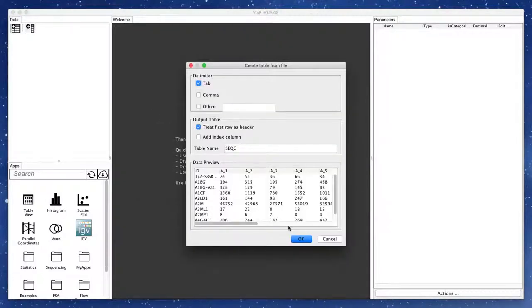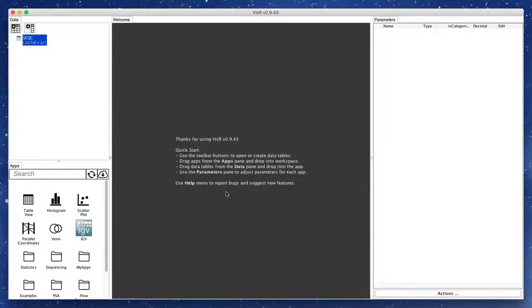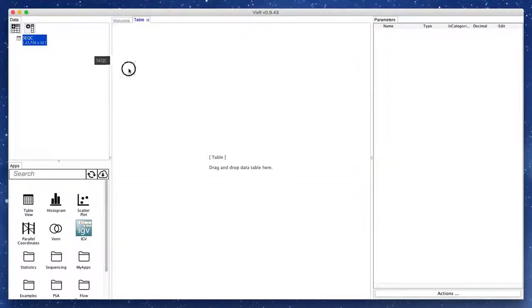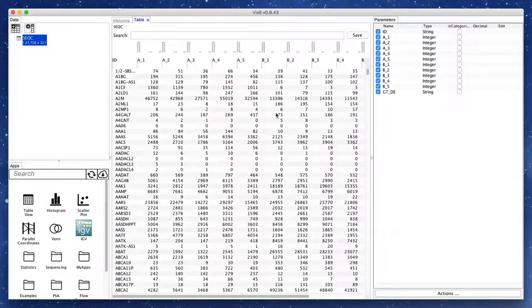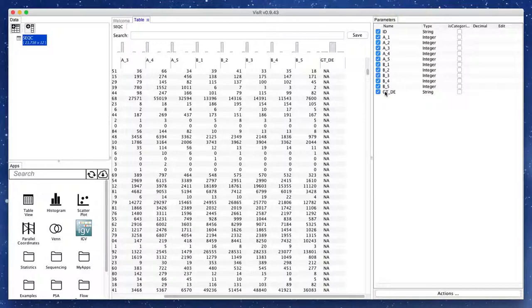Here we import a data table of gene expressions acquired using RNA sequencing technology. We can browse through the data table using VizR's built-in TableView app. In addition to the real genes, it also contains 92 synthetic genes with known expression called spike-in genes.